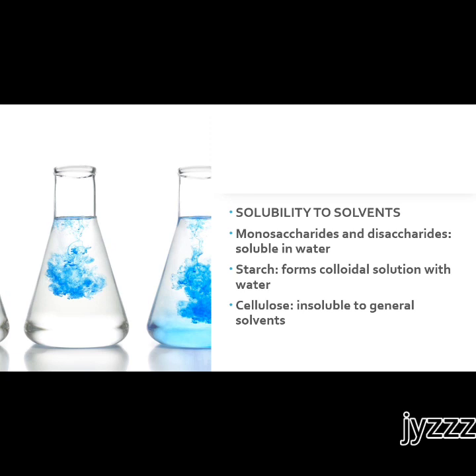Your monosaccharides and disaccharides are soluble in water. Your starch forms a colloidal solution with water, and they are somewhat slightly soluble. They form a colloidal solution. But when you boil, when you increase the temperature of your solvent, your starch will be dissolved completely.